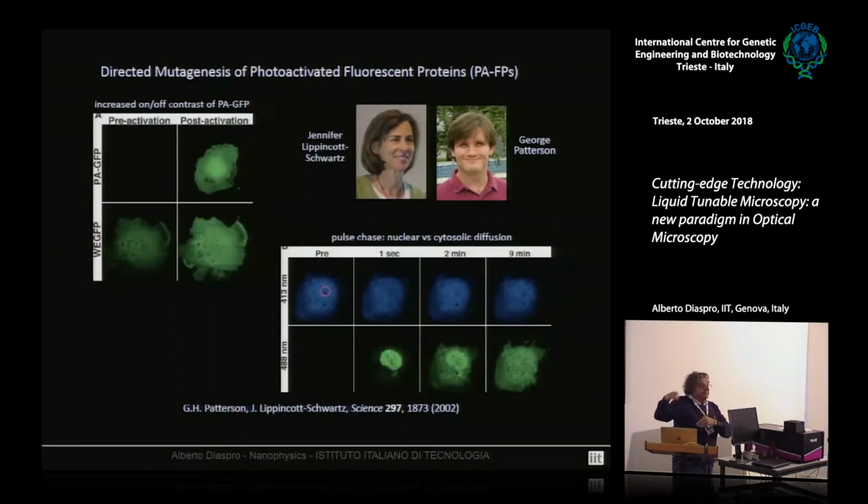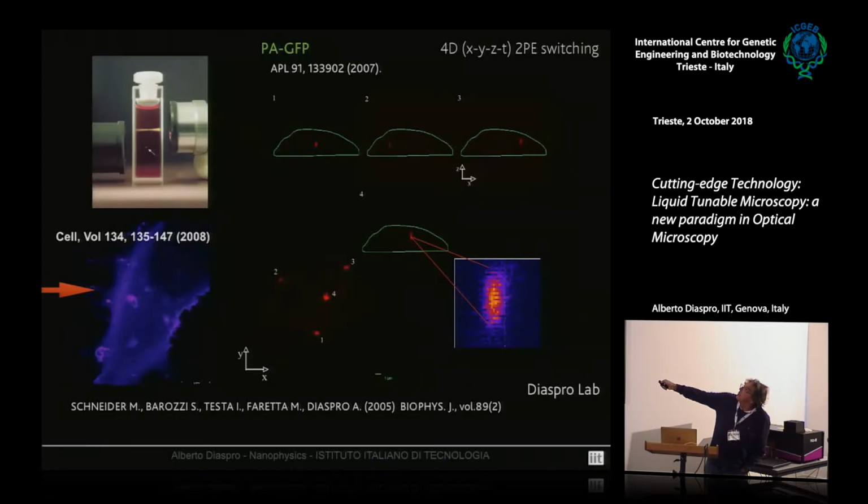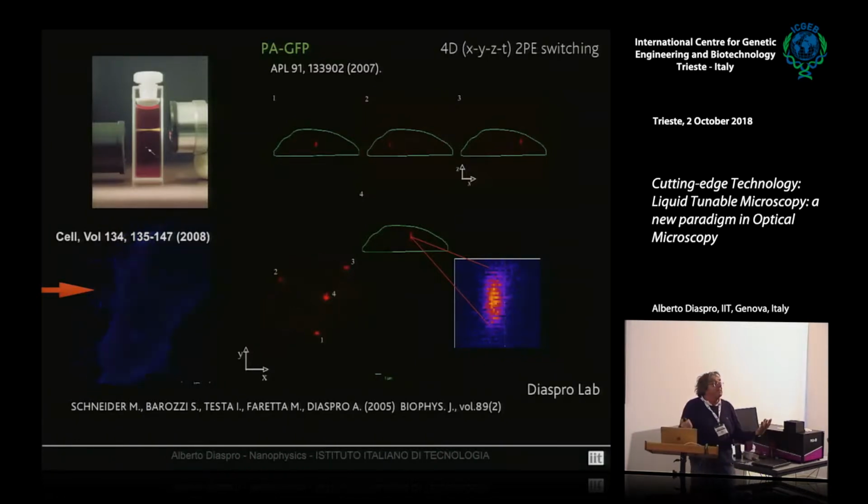This is great twice, because with a green fluorescent protein, you are able to have your fluorescent label expressed by the sample when you want, close to the molecule you are interested in, and now you can decide when you want to switch it on. And you can also decide in which region of the cell you want to focus your attention. So, for example, in case this is the scaffold, you can induce switching on in regions within the cell or in the membrane or wherever you want, or you can detect, by switching in an appropriate way, green fluorescent proteins contained in the vesicle if they go to the membrane or not. So really you can design new experiments.